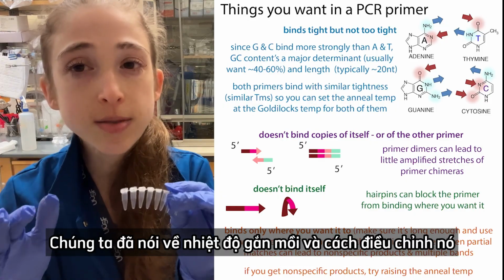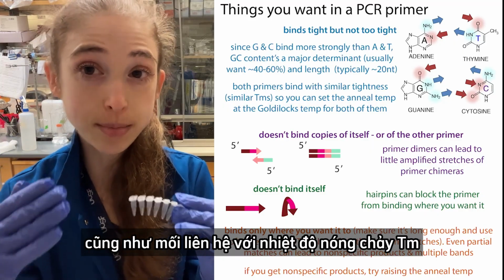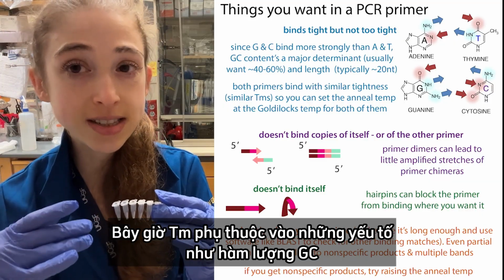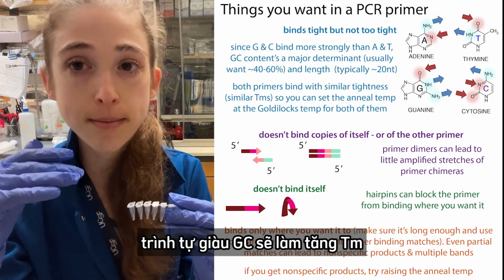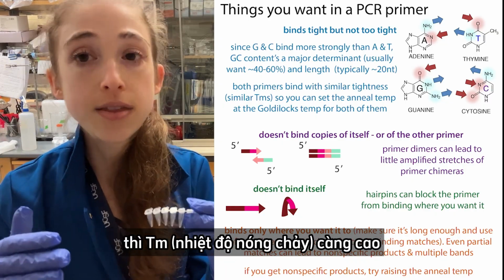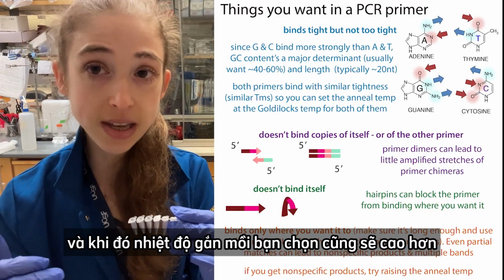So we talked about the annealing temperature and how we could adjust it, and how that was related to the melting temperature, the TM. Now the TM is going to depend on things like the GC content. GC-rich sequences are going to increase your TM, as well as the length. So basically, the longer it is and the more GC there is, the higher the melting temperature is going to be, and the higher your annealing temperature is then going to be.